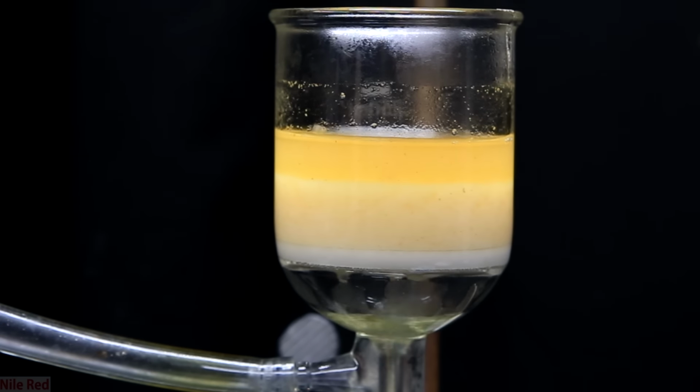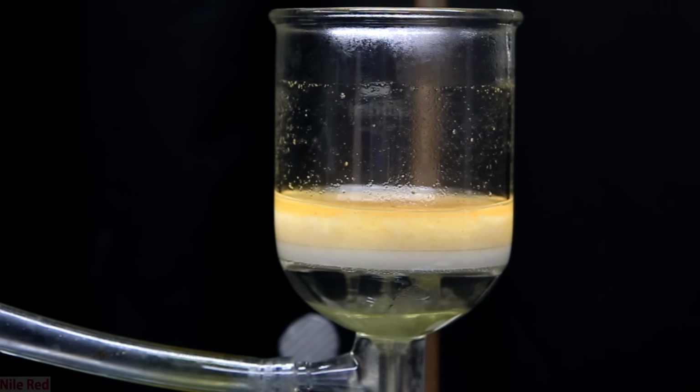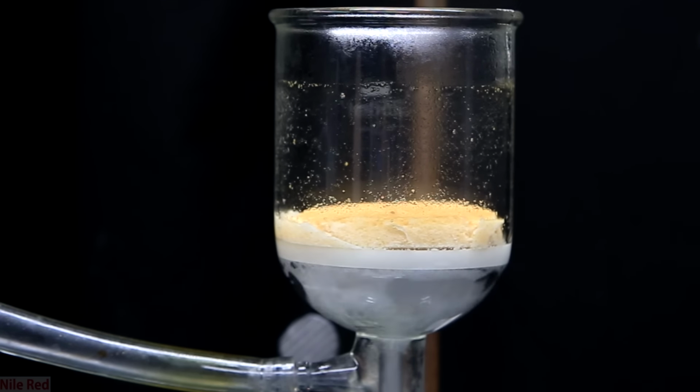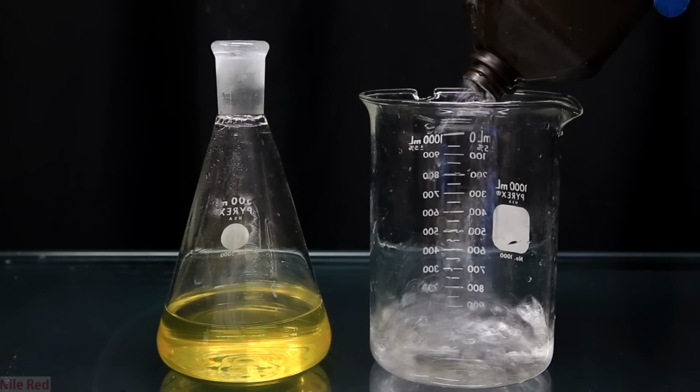There's really not too much harm in adding too much though, because the worst that can happen is you use more hydrochloric acid and you have to do this filtering step. Anyway, once we filtered it, we're left with a nice clear yellow solution.